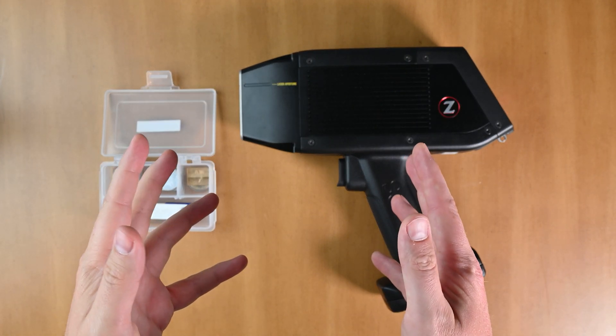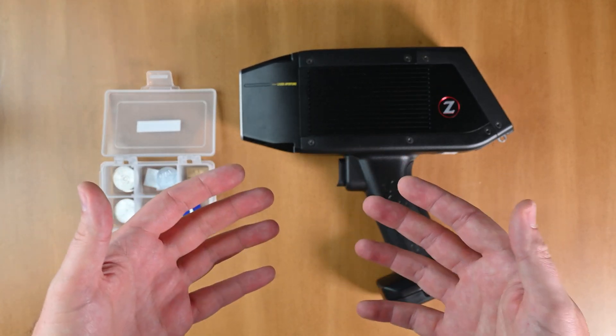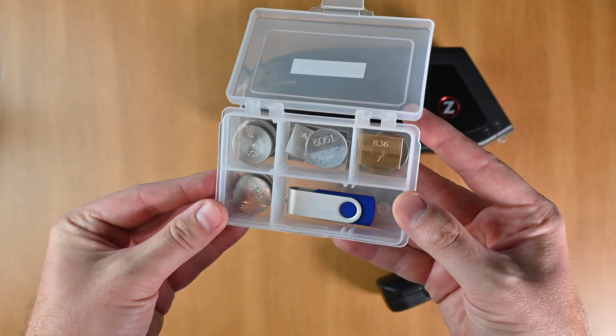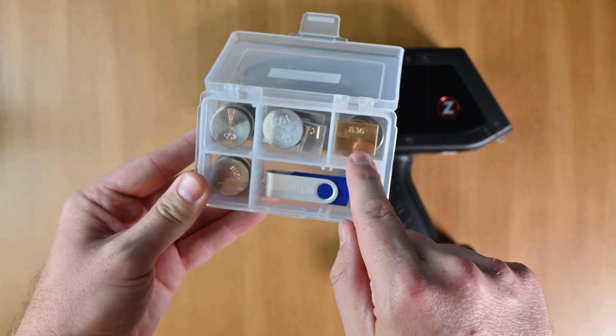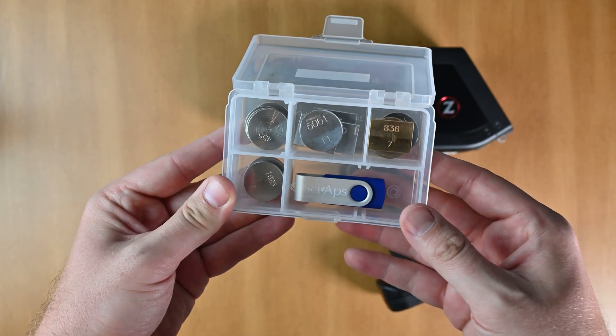The first thing we need to talk about is why we do drift correction. This actually helps us get results closer to what we're supposed to be getting in the field. Each one of these samples is in a metal kit. You can see 6061 aluminum. There are other kits in here as well — a copper set of samples, a stainless steel set of samples, and a nickel base set of samples.